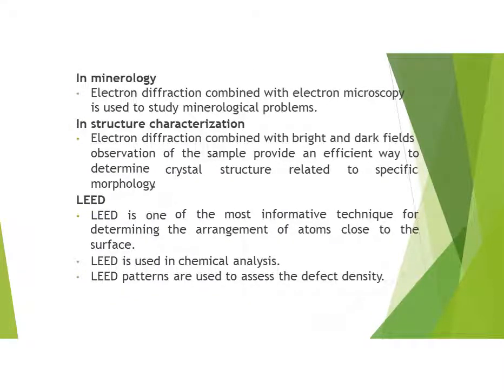In mineralogy, electron diffraction combined with electron microscopy is used to study mineralogical problems. In structure characterization, electron diffraction combined with bright and dark field observation of the sample provides an efficient way to determine crystal structure related to specific morphology.